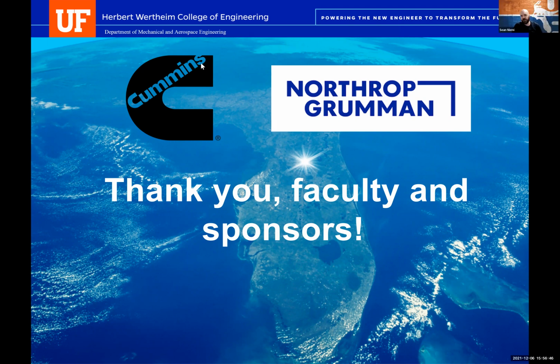I guess I'll go ahead and ask my question then. I've actually got 2 of them. You mentioned close to the beginning that you did testing on angular misalignment of the tool plate, which you're the only ones so far today, unless I don't remember correctly, to mention having done that. But you said it was 3.96 degrees, which is a lot. So what does that equate to for tip position down at the bottom relative to your tool plate?